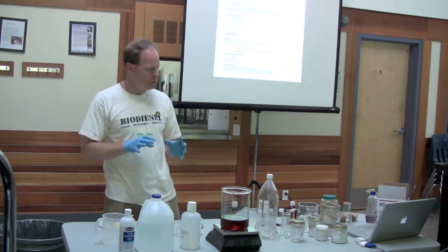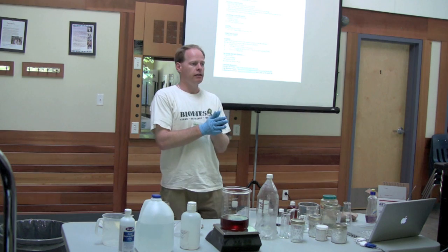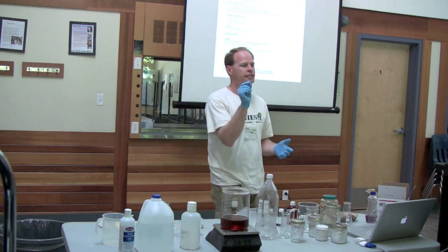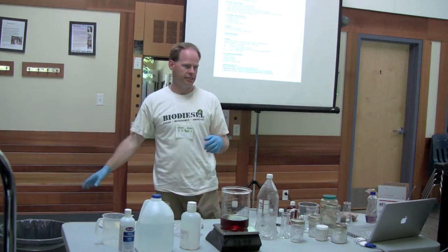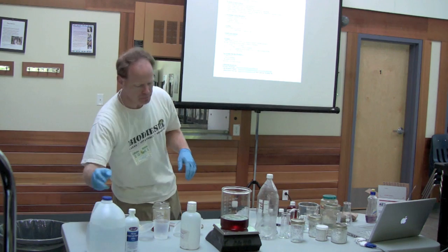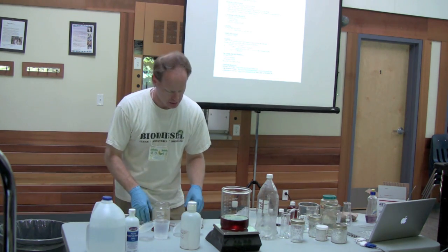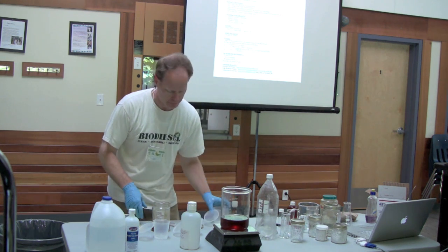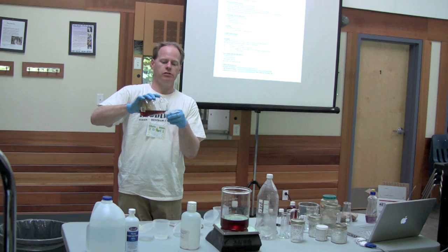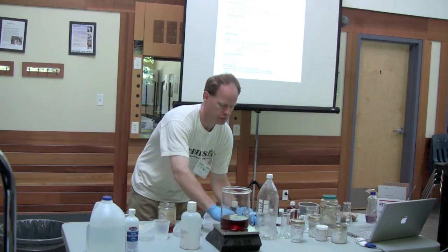Titration is the most important measure in making biodiesel. If I'm playing with a 100 to 200 gallon batch and I screw up that titration, I can screw up the whole batch. So this is the most important part. Measuring out the liter of water and measuring out that 1 gram is the most important thing you can do, okay? Okay, so let's titrate. Let's have a little bit of fun. I'm just gonna pour a little sample of this oil in this, and this will be my source container. This is what we'll titrate in.